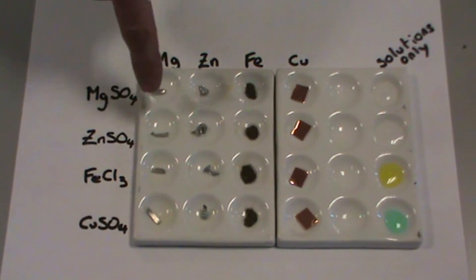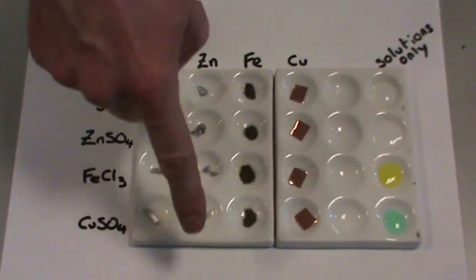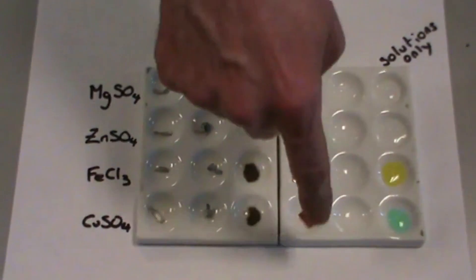Here we have a piece of magnesium, a piece of zinc, some iron filings, and a piece of copper.